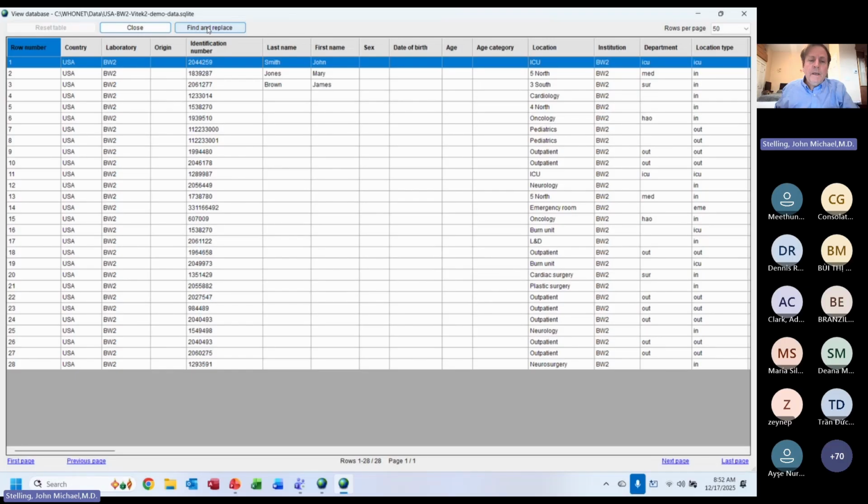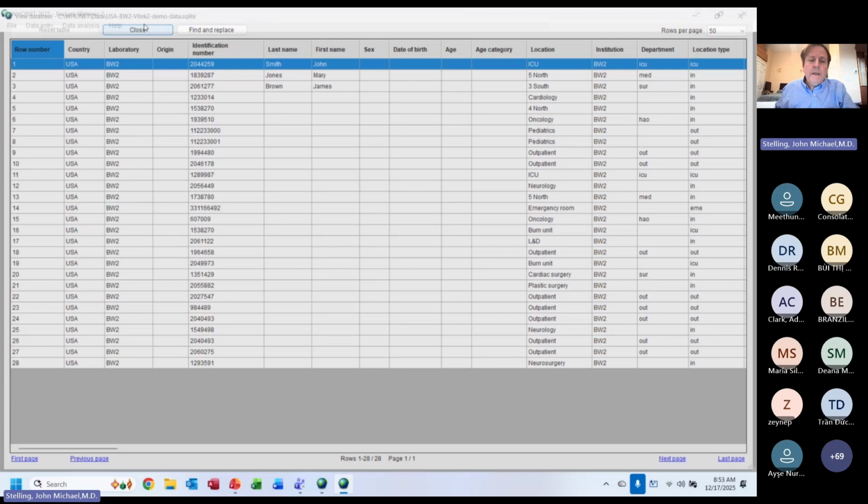So we did this a few years ago, at the beginning of the Fleming Fund, and we never finished it. So right now you have two ways to see this file inside of WHONET. Inside of the data entry program, that's the way that's always been there, including Print Clinical Report, but there's no search and replace feature. Or here, where there is search and replace. Eventually we're going to merge the two functionalities together. It was just because we had other priorities. This was never a high priority feature, but it's something that we do want to do. The two things are almost the same, but we need the functionality to be identical before we delete one or the other. We need to merge them.